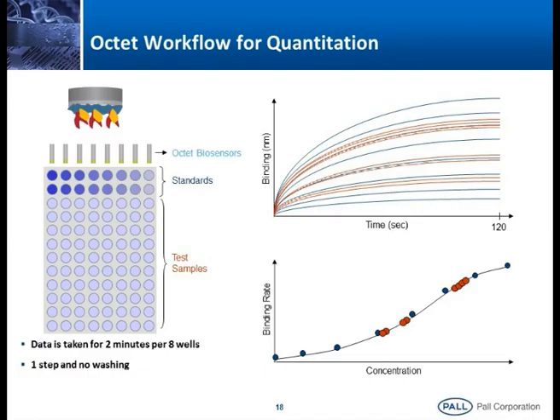How exactly does it work? For quantitation, I am dipping 8 sensors here. You can generate different concentrations, say from 100 microgram per ml, with 2-fold dilution. With 8 concentrations, we can determine 8 samples read at a time. Think about performing even a UV based measurement on one sample: how much time will it take? Roughly 8 concentrations or 6 data points take half an hour. Each time you have to wash the cuvette and then put in the next concentration.